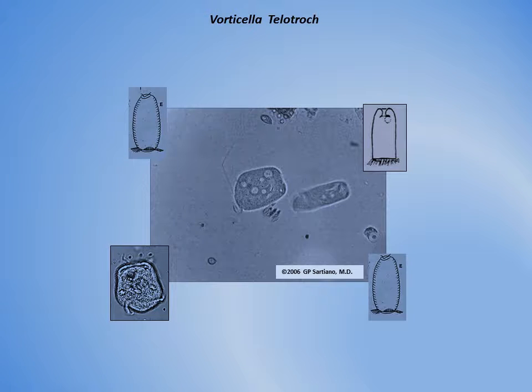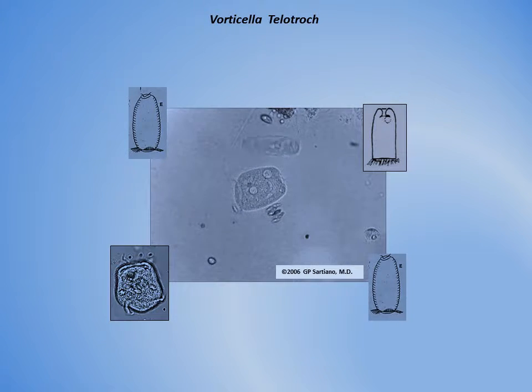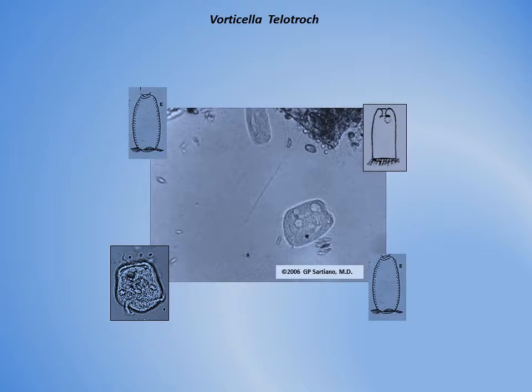The wide globular telotroch in the center, which resembles the overlapping photomicrograph on the viewer's lower left, is about to break away from its long, fragile stalk. The narrower telotroch, which resembles the other three corner drawings, is already swimming freely.